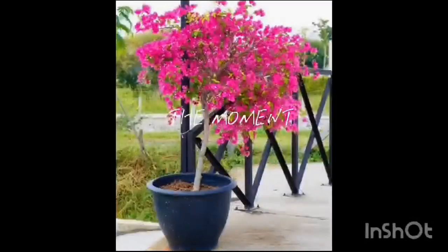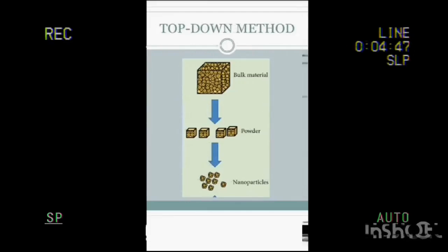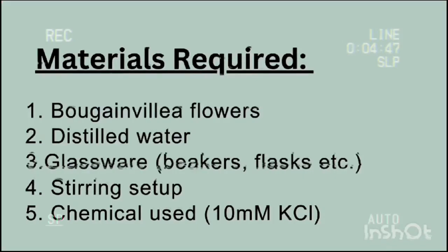Today we are going to perform an experiment on preparation of nanoparticles using a bougainvillea extract. In this experiment we are using the top-down approach. The materials required are given below.